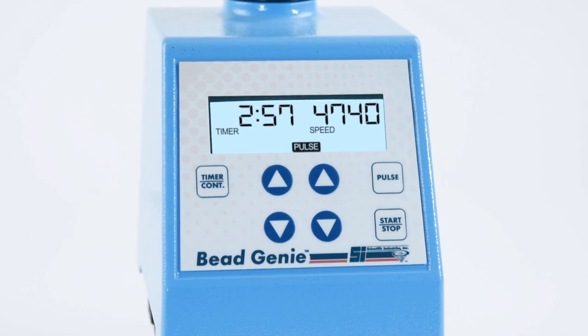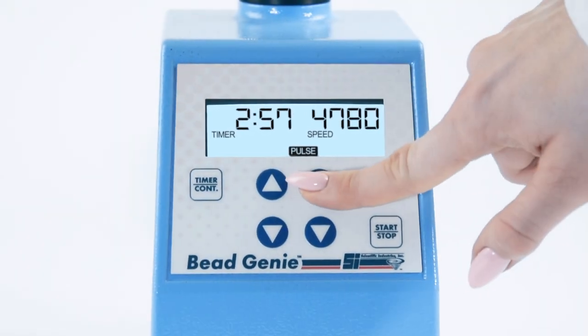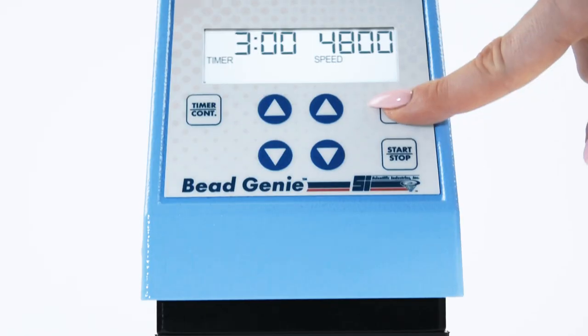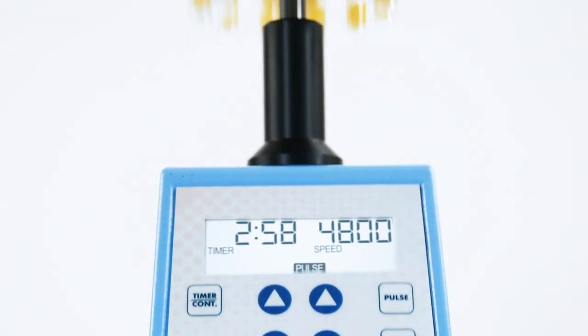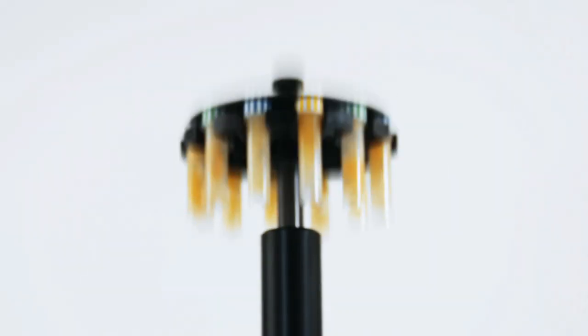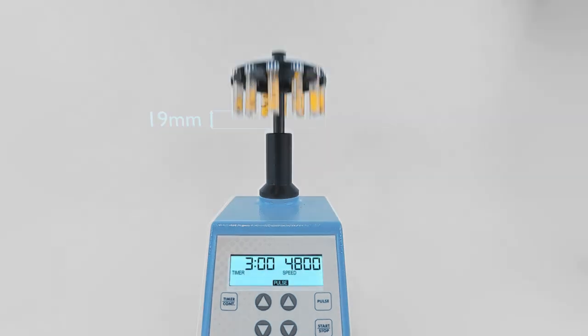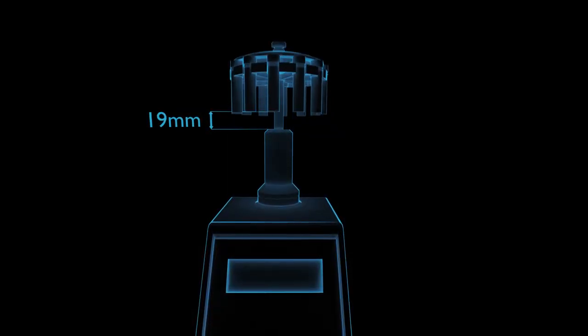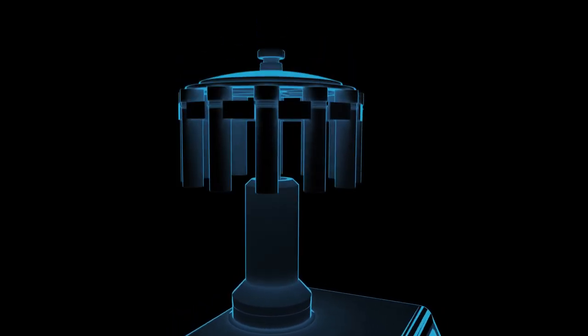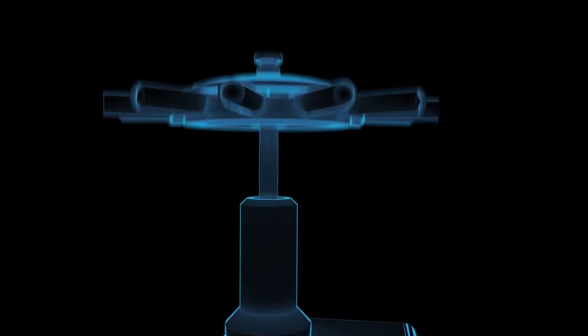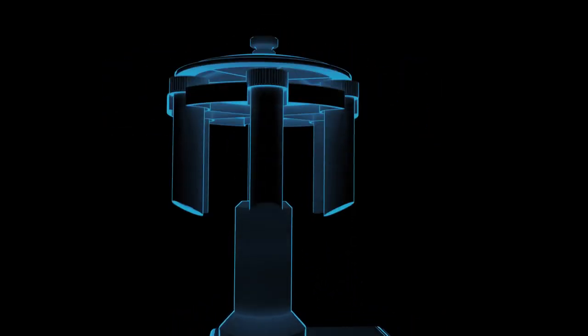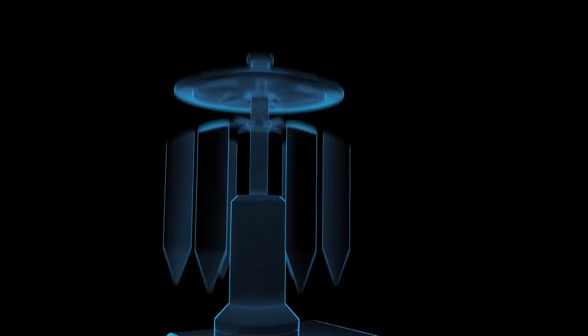The Bead Genie is no ordinary bead beater. It's fully configurable with speed, time, and on-off pulsing for consistent results and repetitive protocols. With a vertical 19-millimeter orbit, 4,800 strokes per minute, and the ability to interchange holders for different sized tubes, the Bead Genie is the most adaptable and economical bead beater in the market.